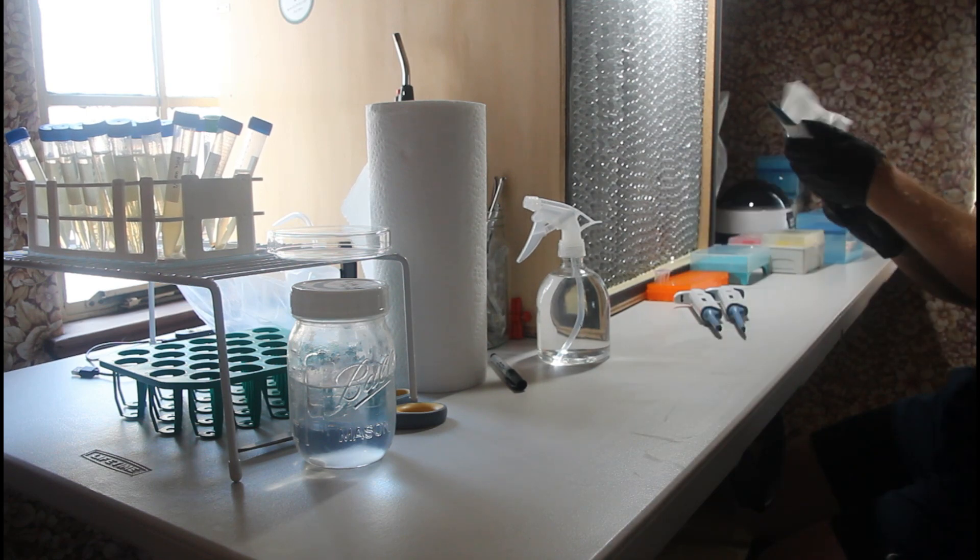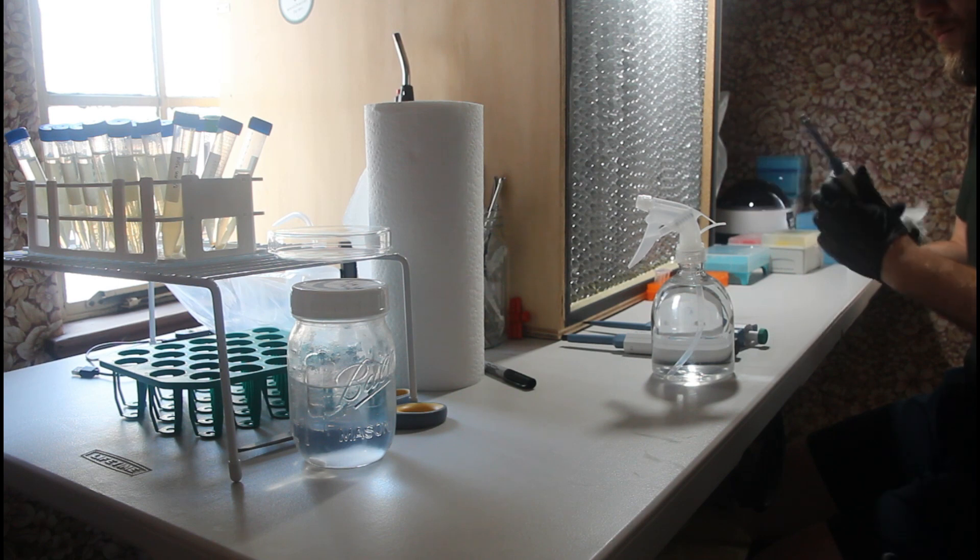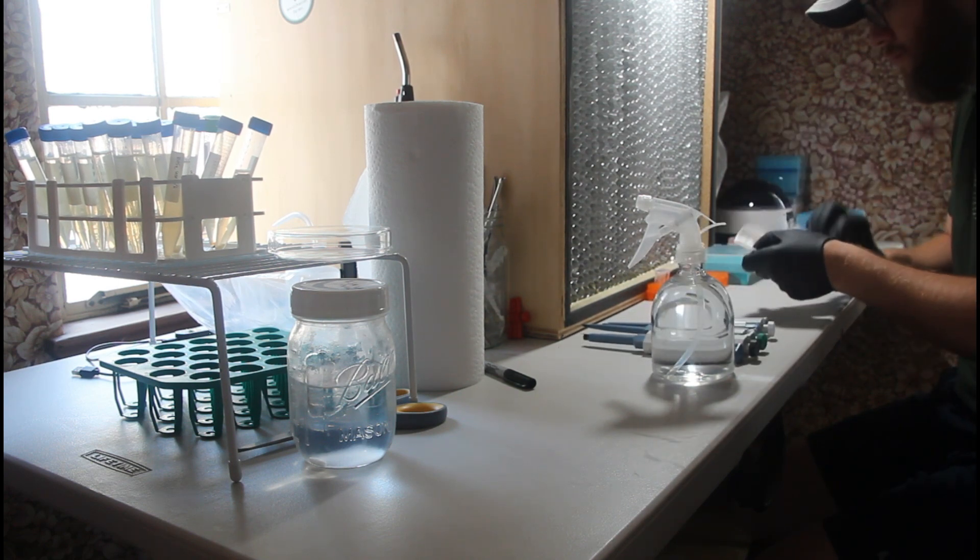You don't need to build a flow hood, as I have here. Plenty of people are successful without one, but I find it improves my odds of unintentionally barcoding a mold that might be hanging around my lab.